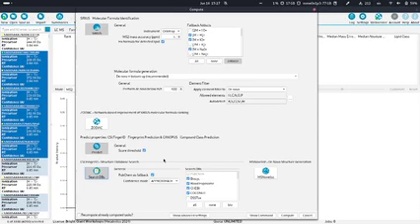And the most important part here is that on the right side, we have this menu where we can select all the structured databases which we search in. Later, when I've shown you the custom databases, you will also have the option to search in your custom databases. So, for example, if you have structures which might not be contained in PubChem or in any other structure library, you will also be able to search these custom structure databases here.